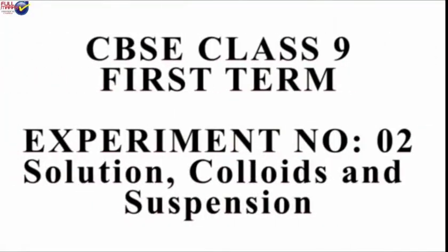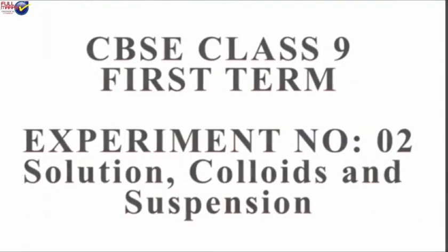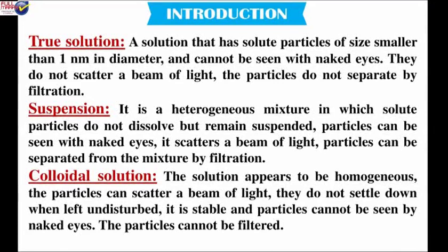CBSE Class 9 First Term Experiment Number 2: Solution, Colloids and Suspension. Introduction: true solution. A solution that has solute particles of size smaller than 1 nanometer in diameter and cannot be seen with naked eyes. They do not scatter a beam of light. The particles do not separate by filtration.